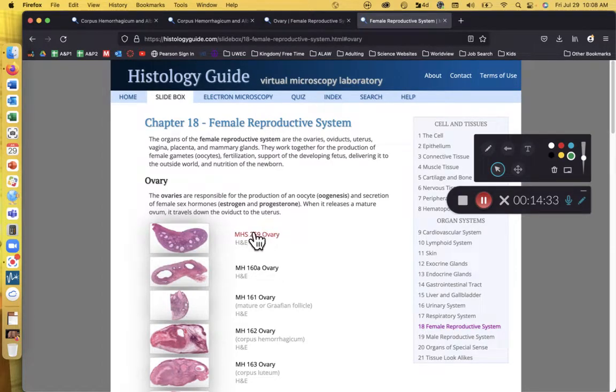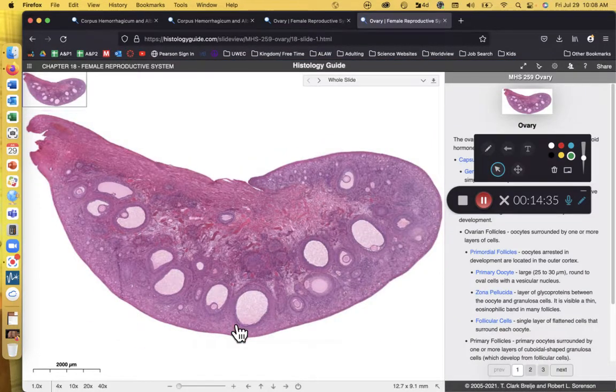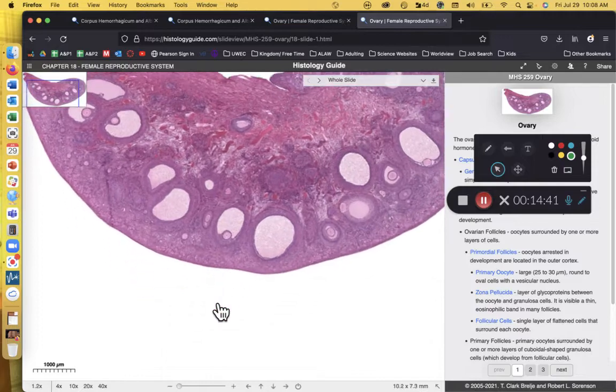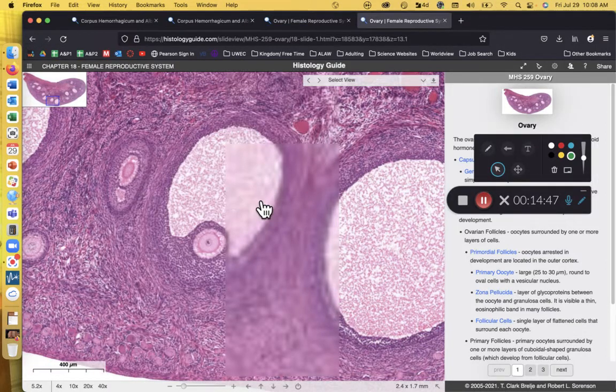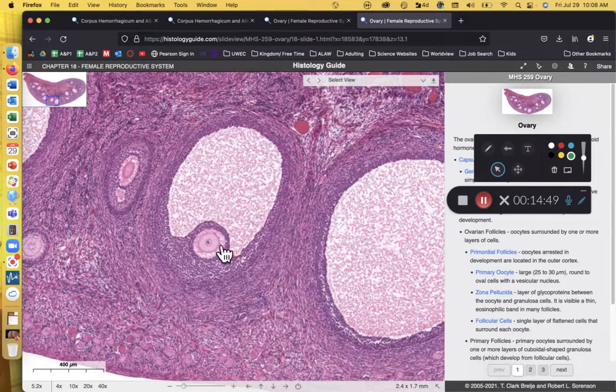So let's pull up this overlay. This is a pretty dependable view for us here. So here we can see a nice mix of follicles. Here, I'll zoom in on this one for us. This is a classic mature follicle. The antrum cross-sectional distance, the short portion, is still much larger than the cross-sectional distance of that secondary oocyte.